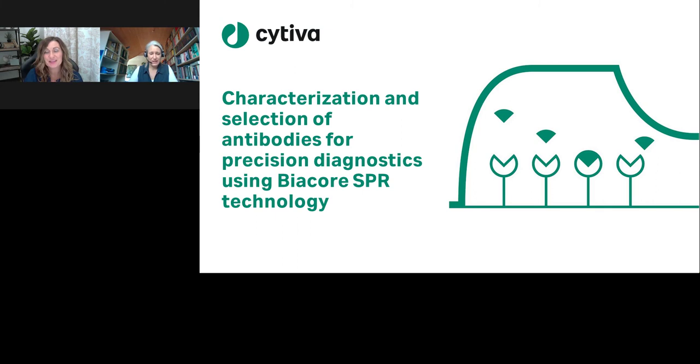Now, Anja, in the example from Biomedical Diagnostics Institute, you showed 8 different scFv fragments screened per assay cycle. How many parameters or reagent candidates can be tested in parallel?